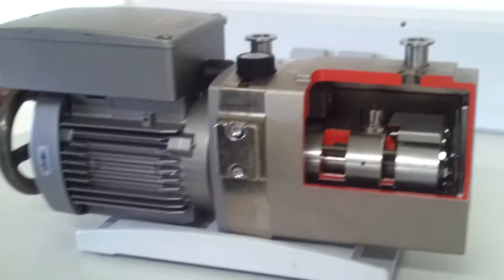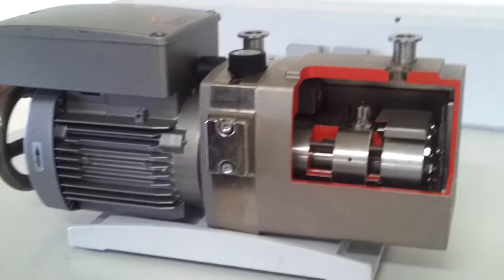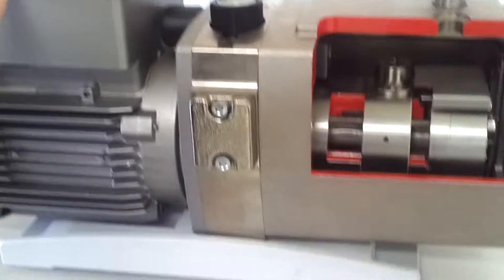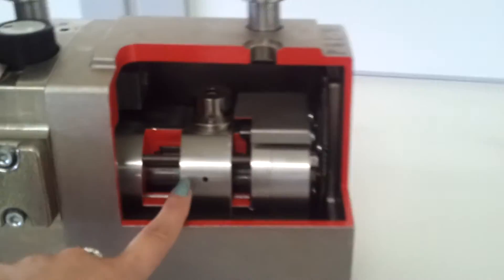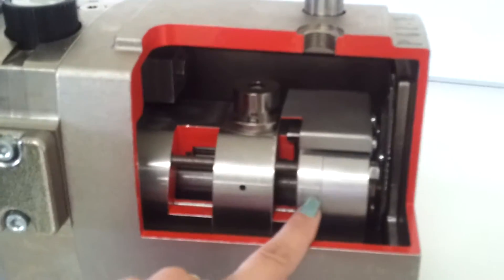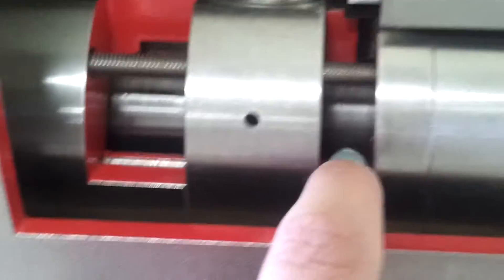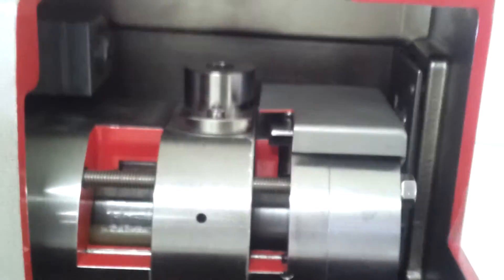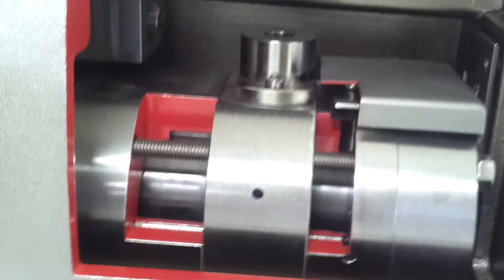This is a rotary vane pump. It's an oil-based pump in which we have the rotor here and the actual pump here, which consists of two stages. We can see the vane here and then the other one here, and it would normally have oil all around it, like an oil bath.